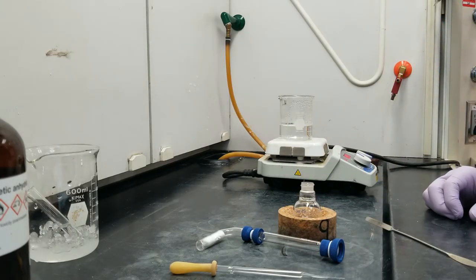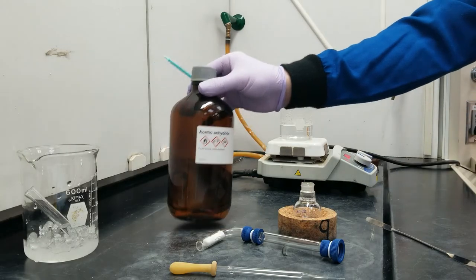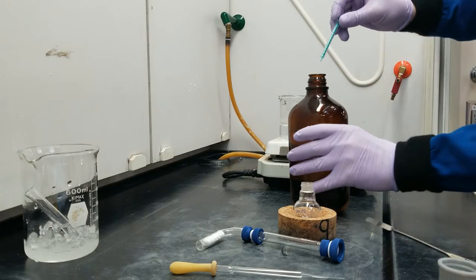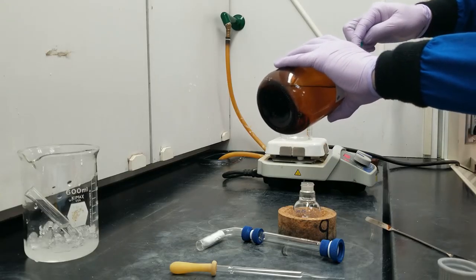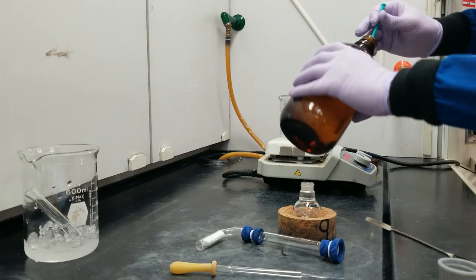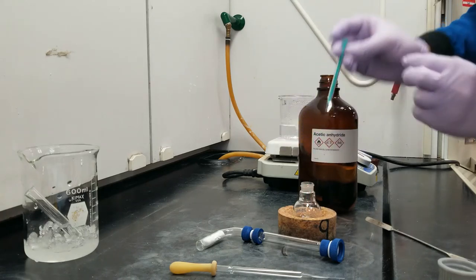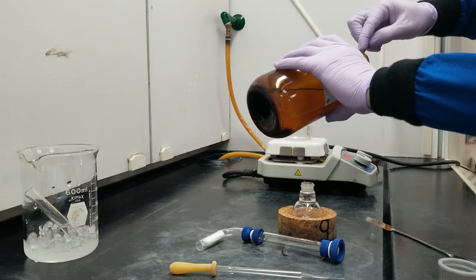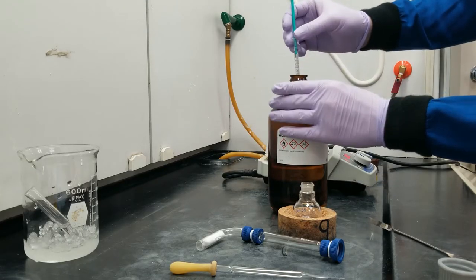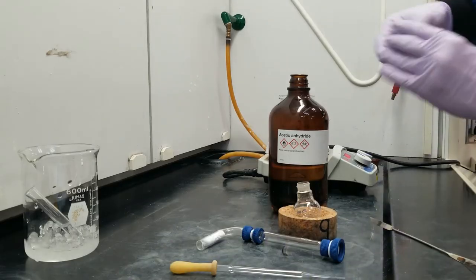So number one is going to be the acetic anhydride. Acetic anhydride, like I said, is rather sensitive to water in the atmosphere. If you leave this uncapped and you just expose it to air overnight, it's probably going to spoil the bottle. You're probably going to lose about half. There's 1 mil, and I need 2 mils. Okay, 2 mils of acetic anhydride.